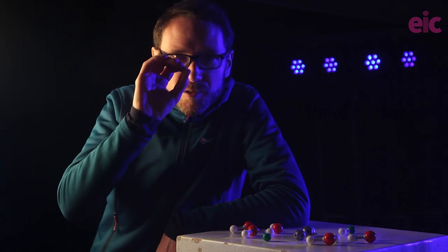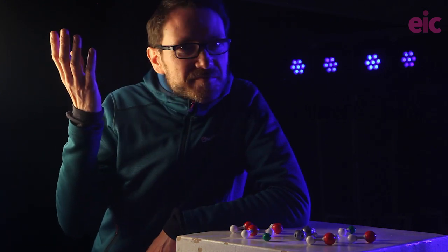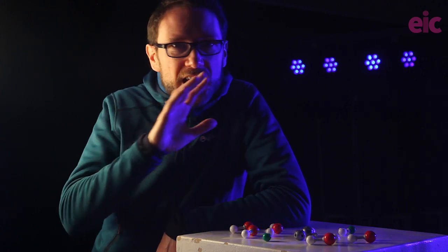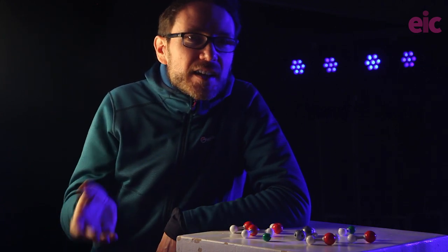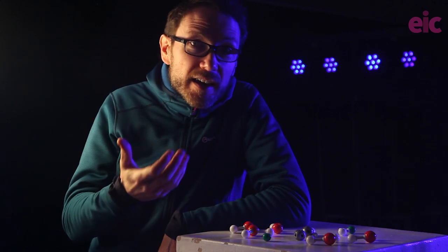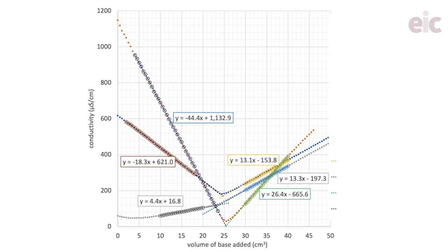So this is where I pull everything together and show you the pièce de résistance. Just like I mentioned in the previous video, you can, with a bit more patience and probably the input of some student-led inquiry rather than as a demonstration, collect data against volume rather than against time. Applying a volume correction to the conductivity values, you can get these curves for the three reactions that we've looked at. These data were collected with concentrations 10 times less than those outlined before, as I have the resolution for it with my conductivity probe.